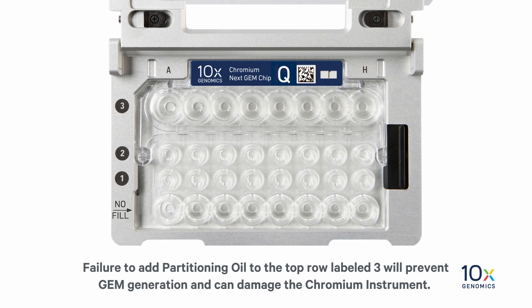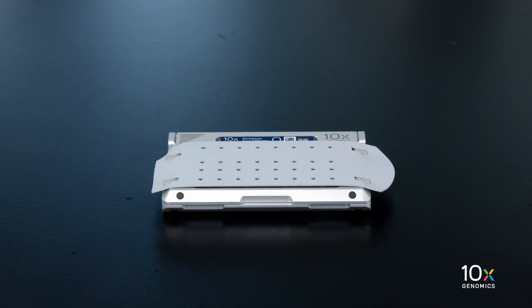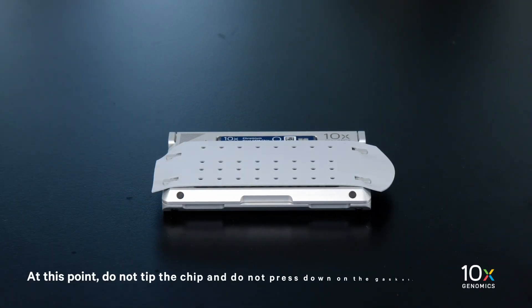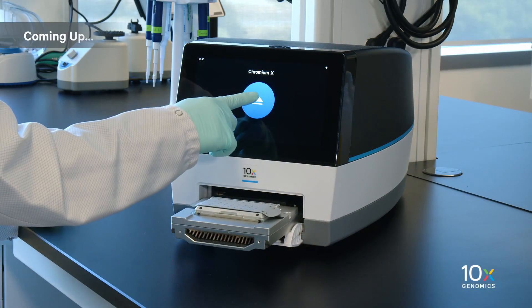Close the secondary holder lid and immediately run the chip in the Chromium instrument. At this point, do not tip the chip and do not press down on the gasket. The chip has been loaded. Next we will run the chip in the Chromium instrument.